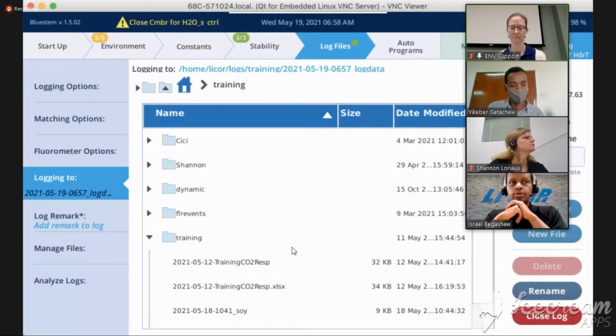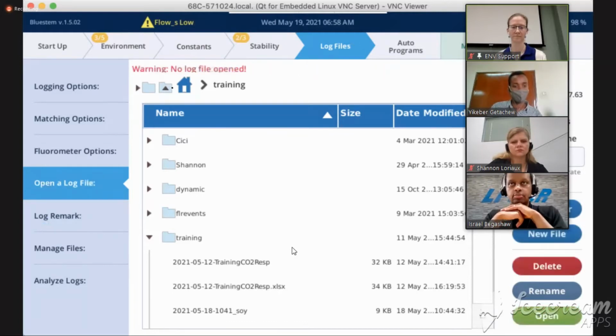Yeah. If you want to do that, yeah. And as I said before, you can continue with the same file.